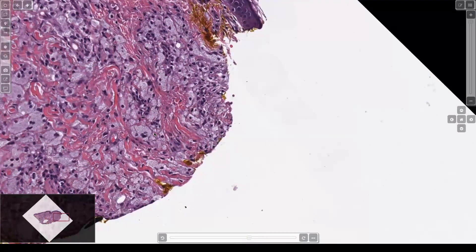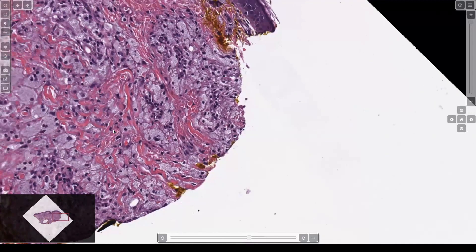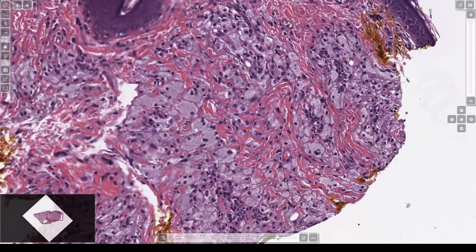Sometimes it can be hard to tell foamy and granular apart. When you look closely you can see tiny little bubbles that are clear because they're made of lipid, and they oftentimes will kind of gently scallop the nucleus, kind of like you'd see in a sebocyte — and that's a good sign that you have a foamy cell, a foamy histiocyte probably.